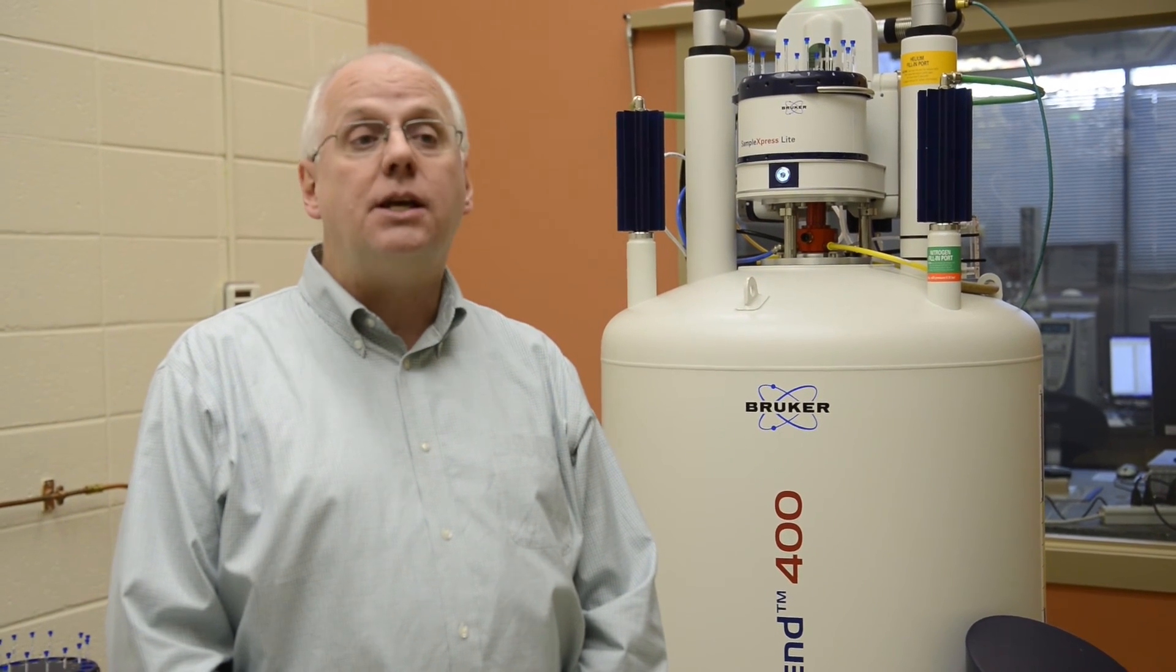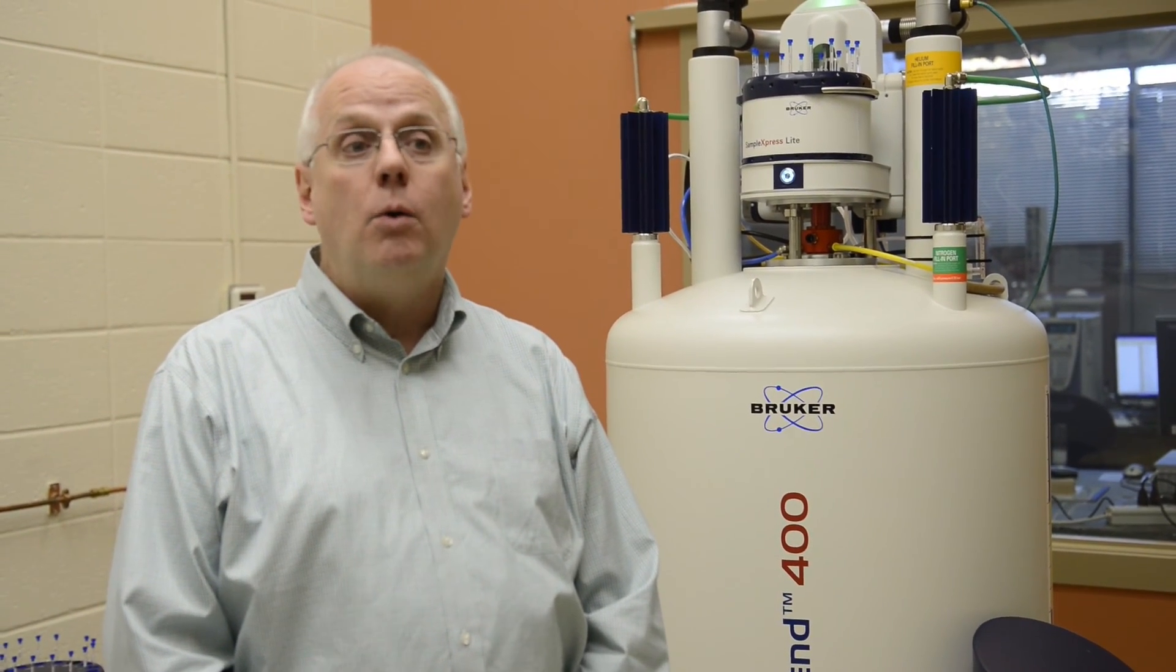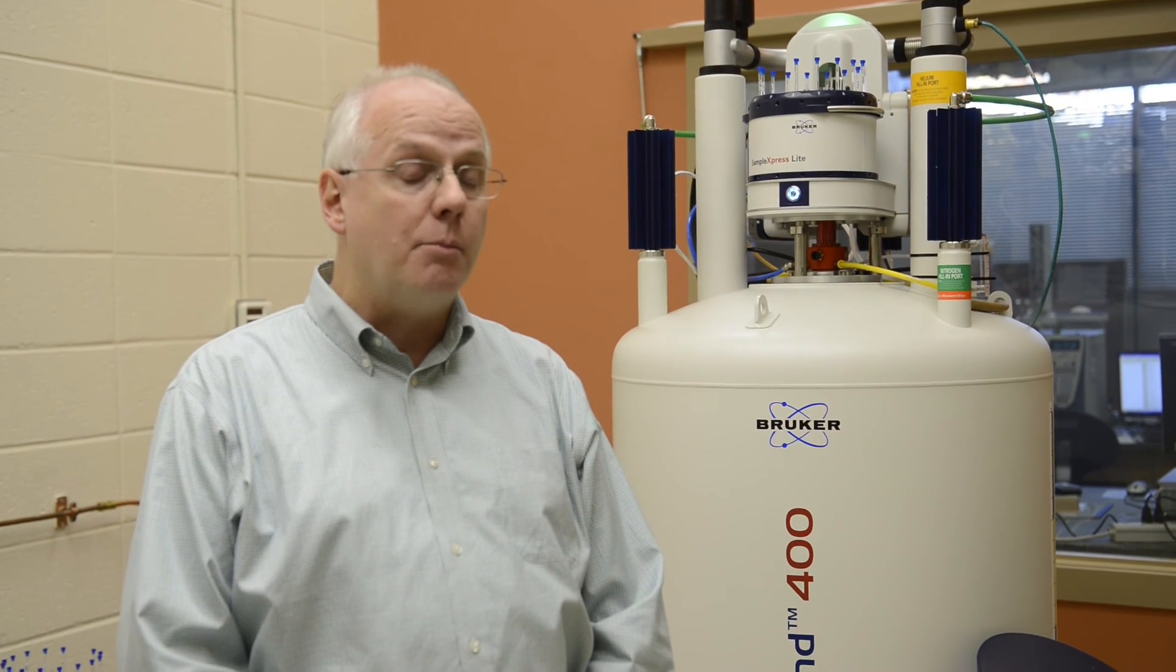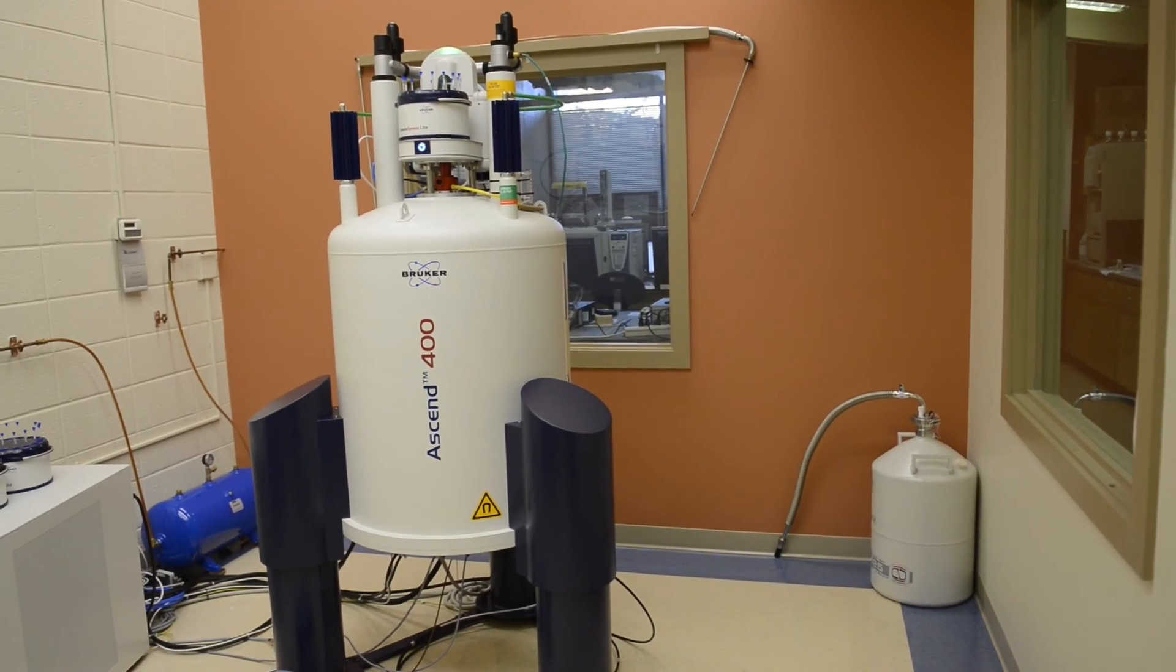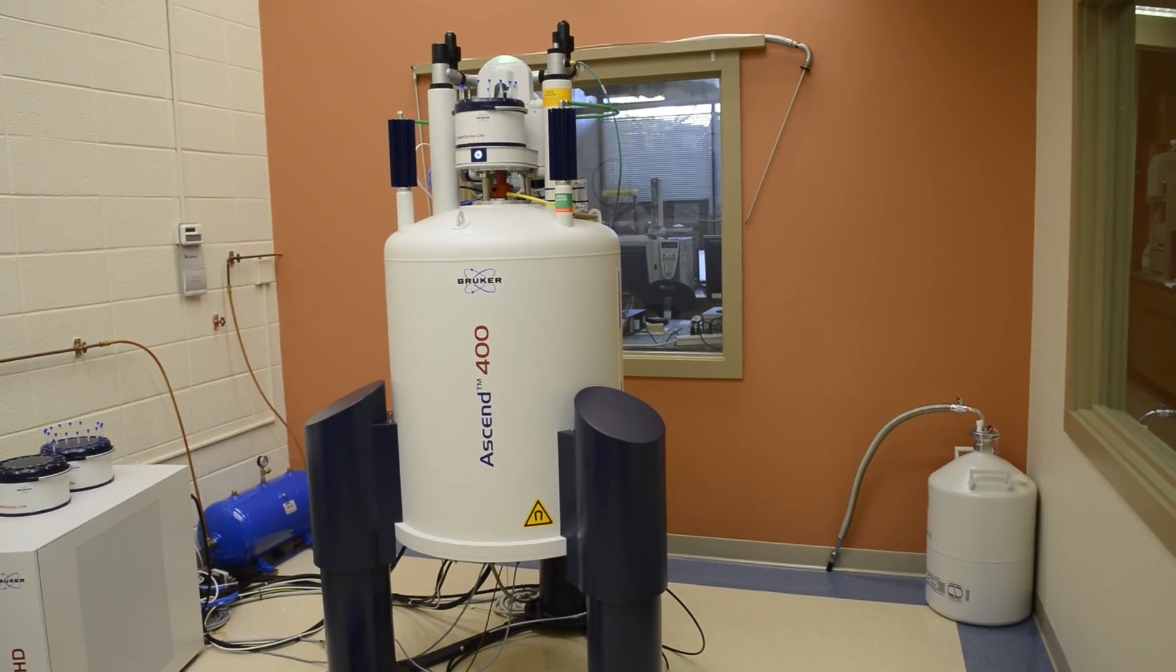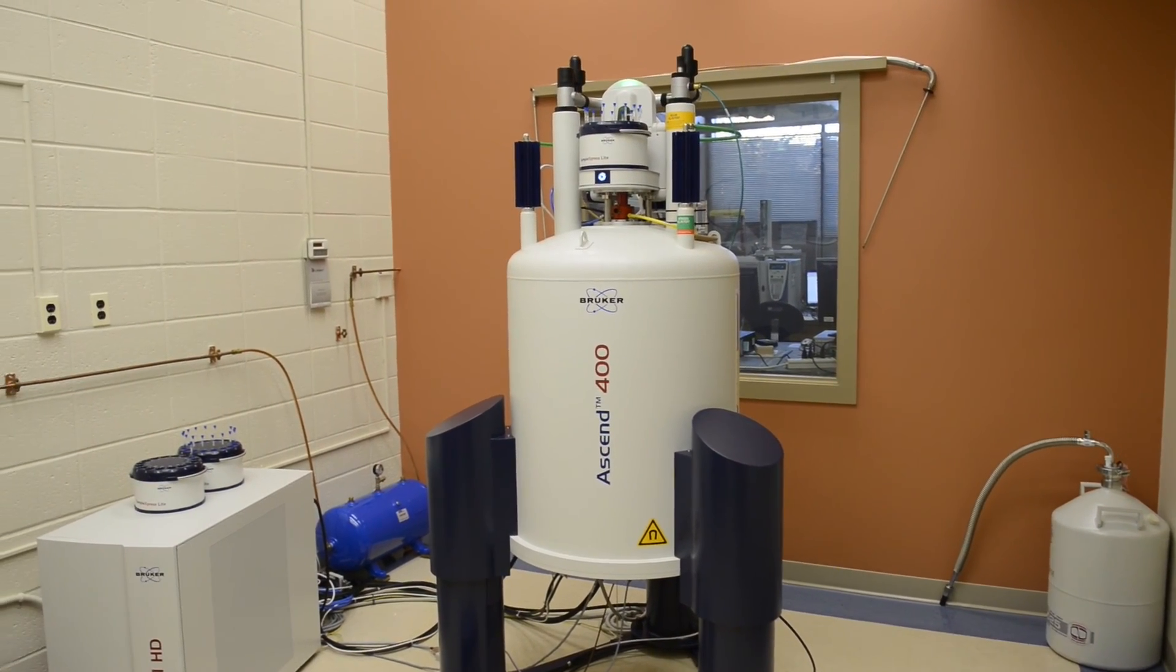Often at larger institutions, students might not even see an instrument like this even though a research institution might have three or four NMRs. They might not see it, and if they did, they wouldn't have the opportunity to run any of their samples through it.